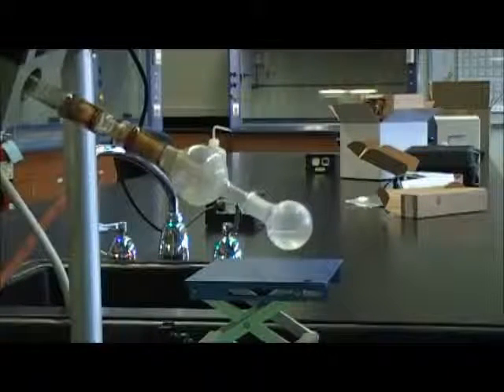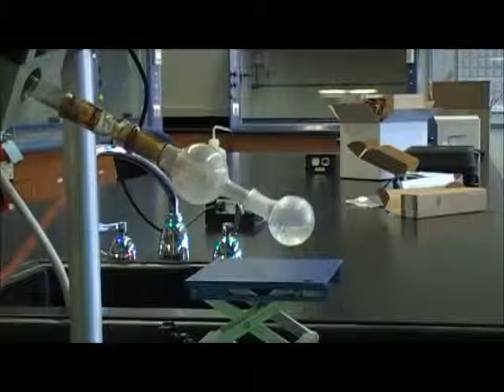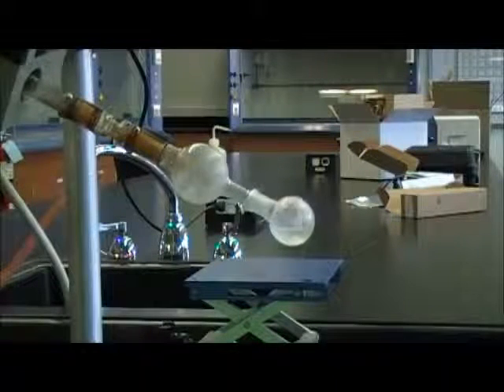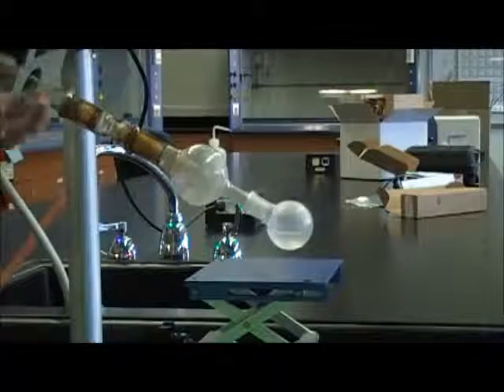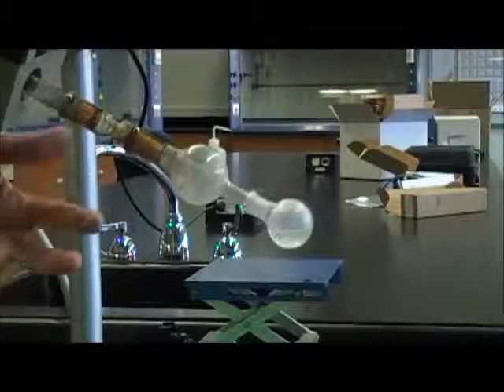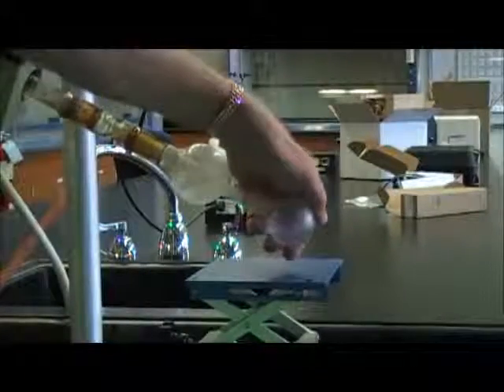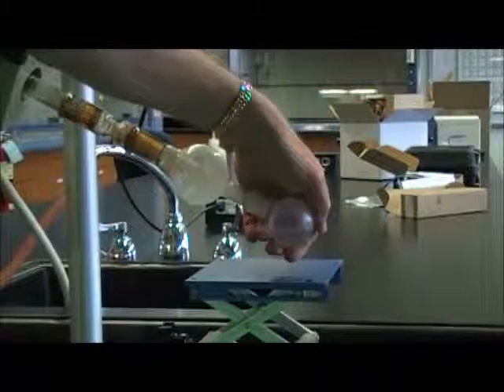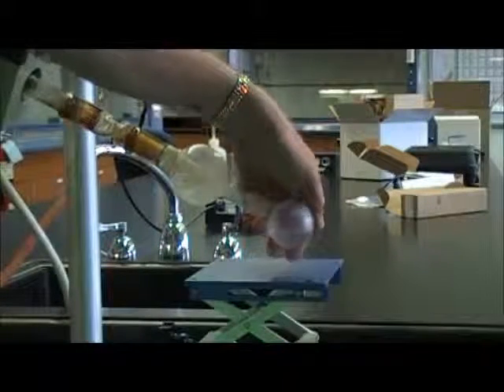Endothermic, meaning heat's going into it. People always get confused by this. They think, well, if heat's going into it, why isn't it getting hot instead of being cold? When heat's going into the process, the heat is coming from somewhere. It's coming from the surroundings, specifically from the glass and from my hand and from the air around it.